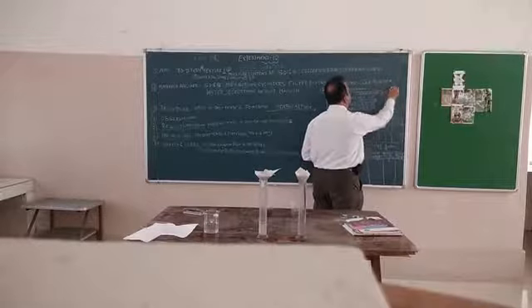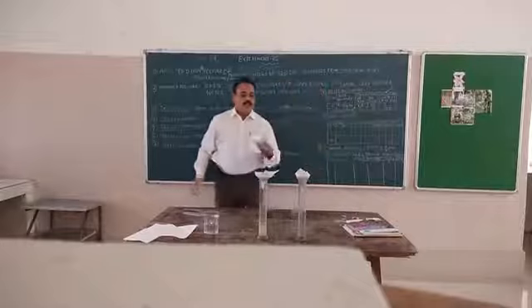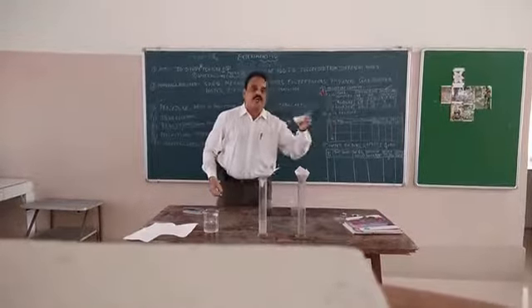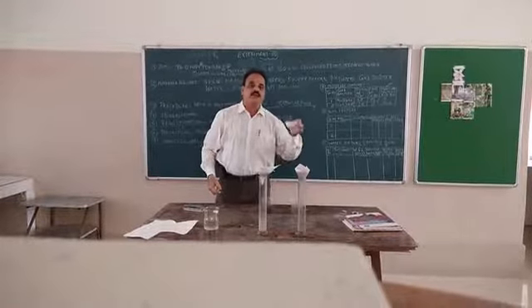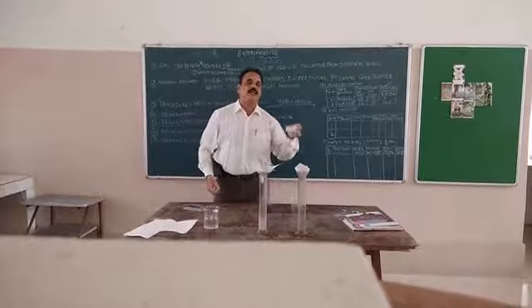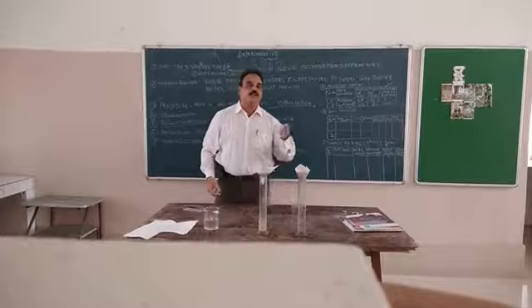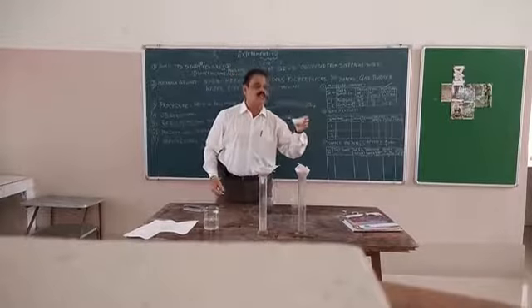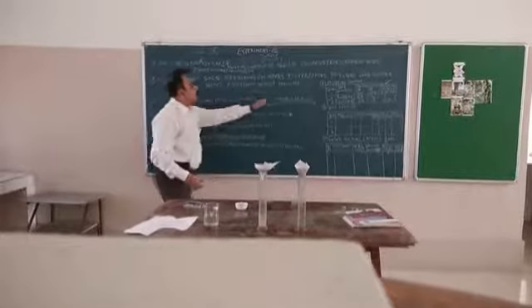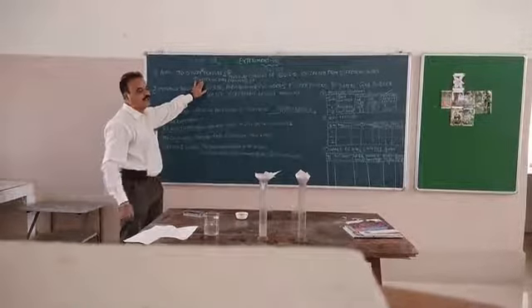So in which soil is moisture more? It is the garden soil. All of you know, whichever soil has maximum moisture, that soil is good for vegetation. Plants will survive very nicely. That also gives an indication that water holding capacity is maximum in the garden soil. So you put that in tabular form, your observation.